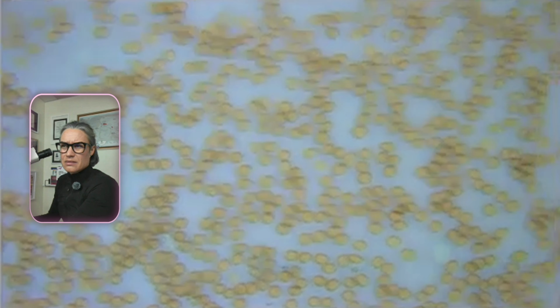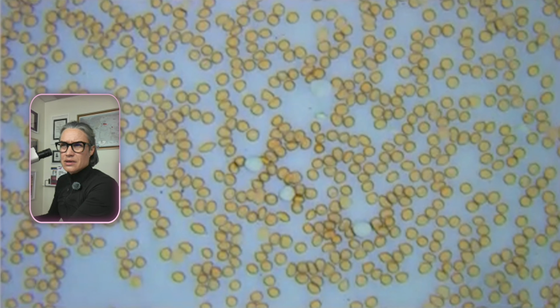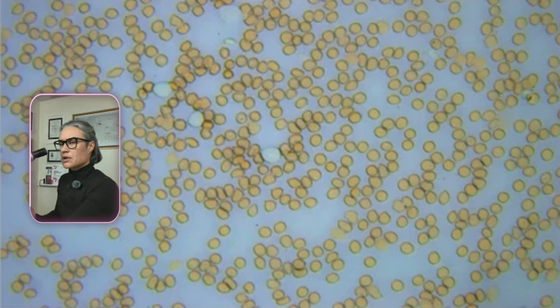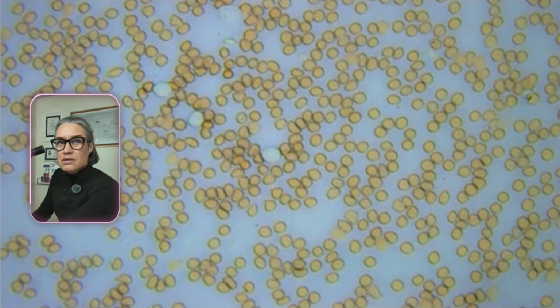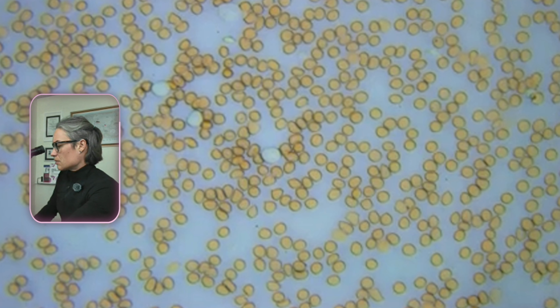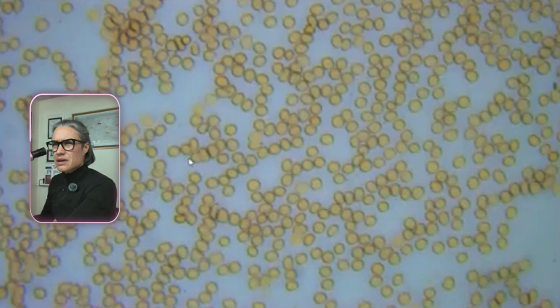Okay, here's something. Here's another one. Here is a bunch. Let us go and check them out. Oh, well, we cannot check them out more than that because I don't have another objective. I'm an anatomic pathologist, so I work with a 40x objective, and to see them better, we would need 60x, 100x. But yeah, this is our blood, or my blood, that I obtained by pricking my finger with a needle.